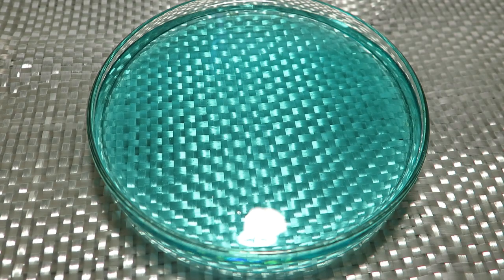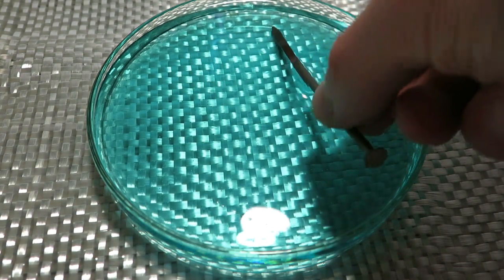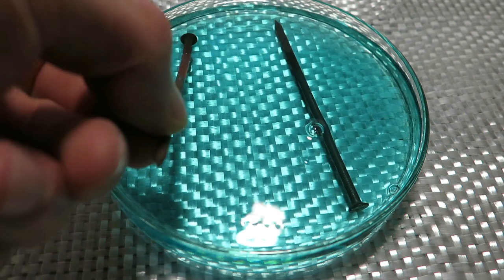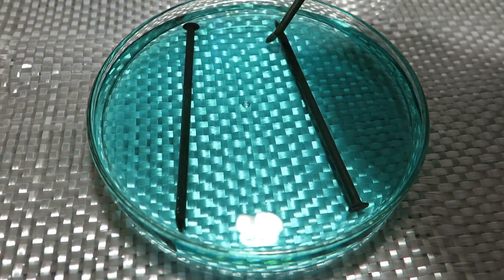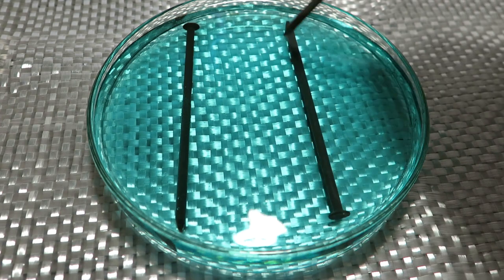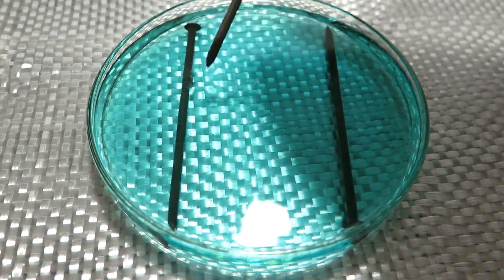Our reducing agent will be nails. I will add 4 nails to the solution. You can see that immediately the nails will turn black. This black color is actually the copper that is deposited on the surface of the nail.